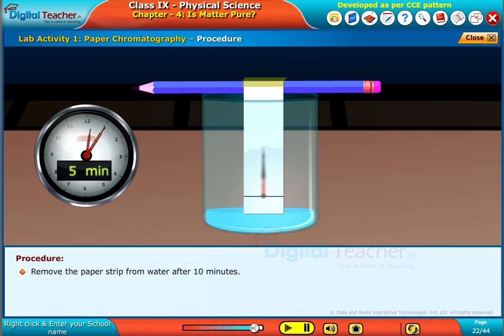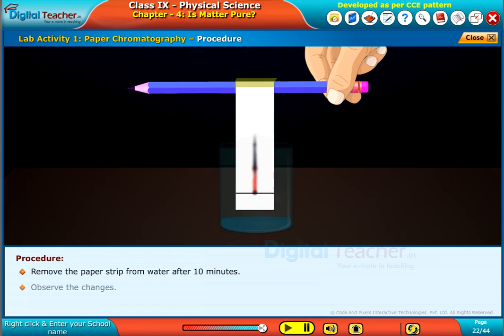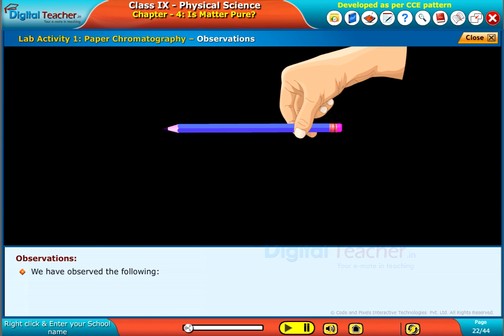Remove the paper strip from water after 10 minutes. Observe the changes. We have observed the following.